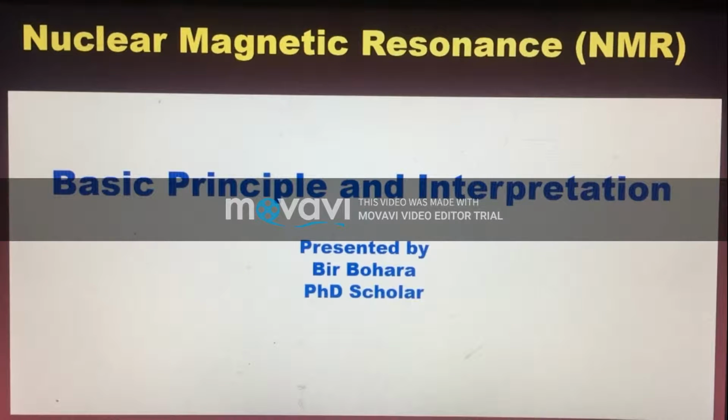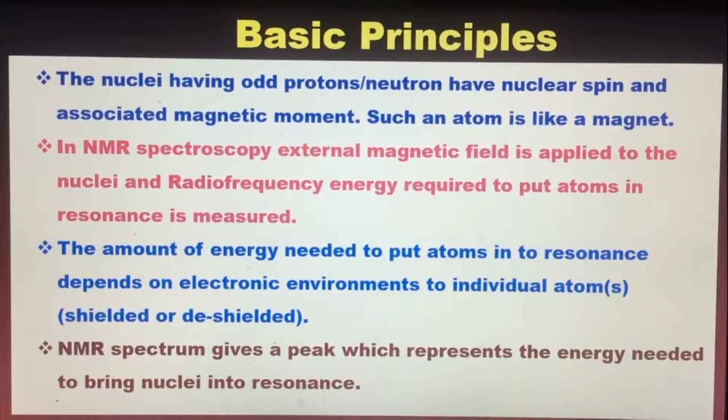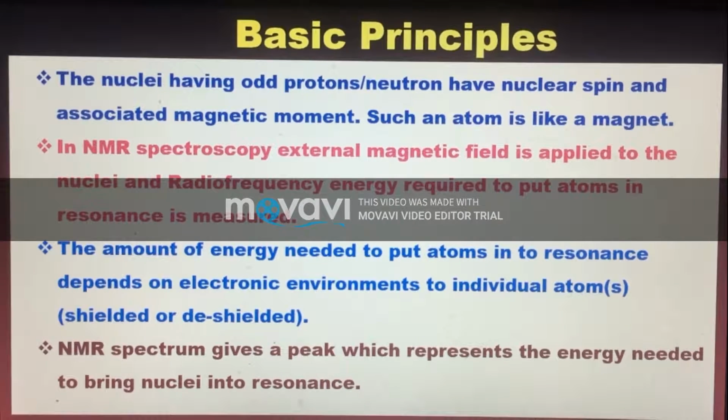In today's lecture, we are going to discuss nuclear magnetic resonance, NMR. Basically, we will discuss the basic principle of NMR and interpretation of the NMR spectrum. Okay. First of all, let's discuss the basic principles of NMR.